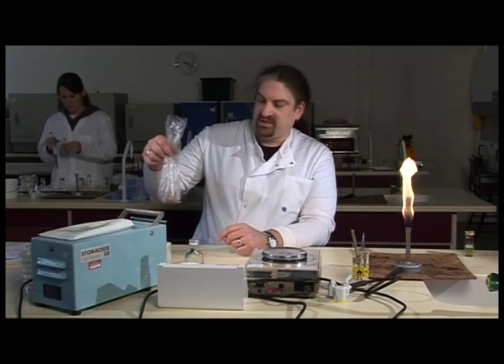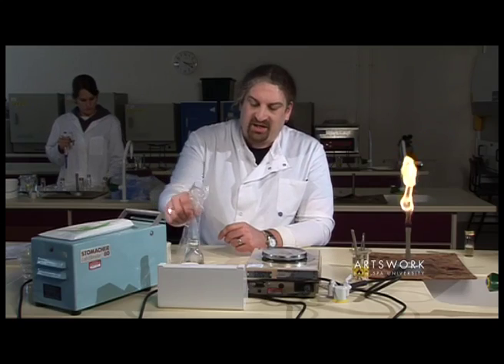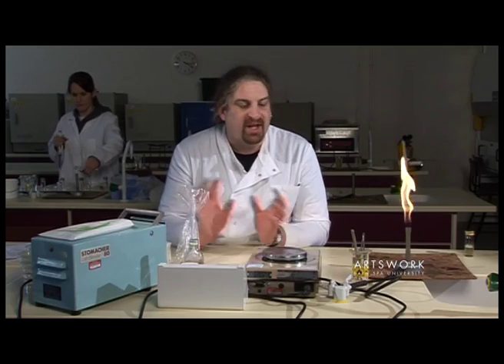In order to prepare a sample for microbiological analysis, we need to take an accurate volume and dilute that in a known amount of liquid.